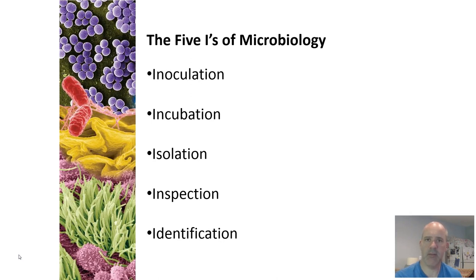All right, first video clip here, we're going to talk about culturing microorganisms in the laboratory, which is basically a fancy way of saying we're going to grow them in the laboratory. So if we want to study microorganisms or identify them, diagnose what's causing an infection, traditionally we've had to be able to grow them in the laboratory. And sometimes that's very easy to do, and for some microorganisms it's not so easy to do.